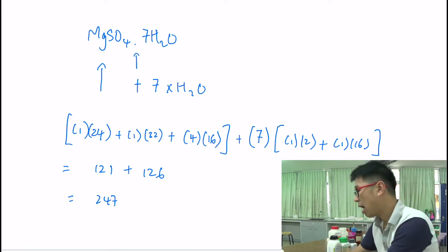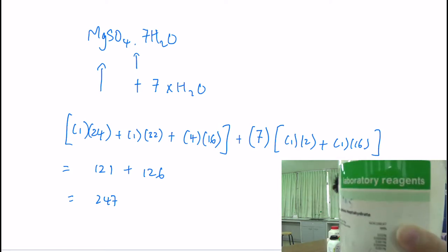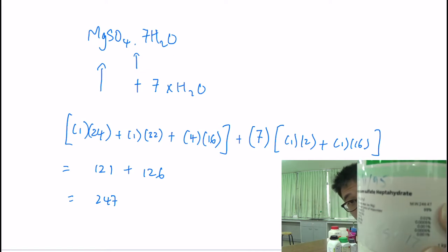This is how we get the mass for 1 mole of it. As shown here, we have gotten 247.